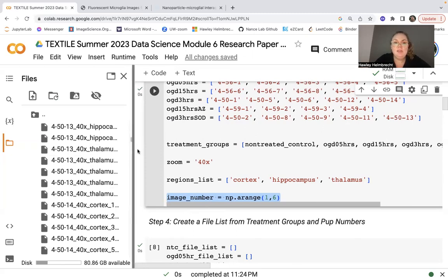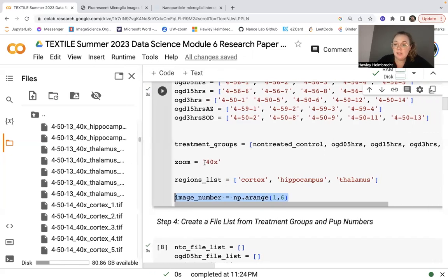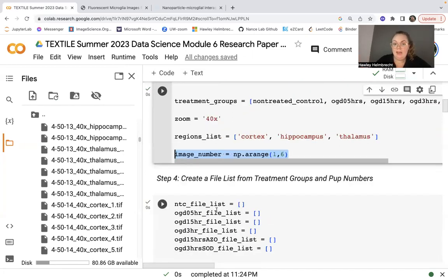And oftentimes we can get a few images per region depending on how large the region is. Here we're using pretty broad regions. In some of my experiments, I use sub-regions of each of these major components. And in that, you can't get nearly as many images. But we don't overlap any of the cells, and so that's what we have here.